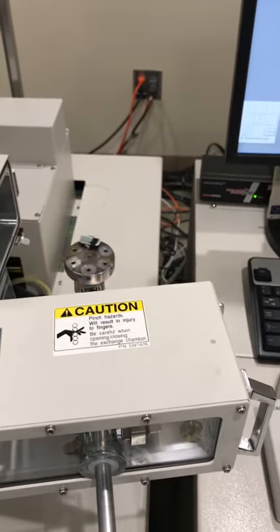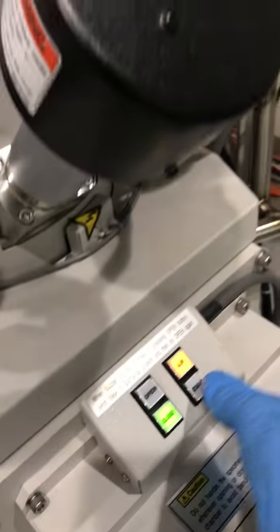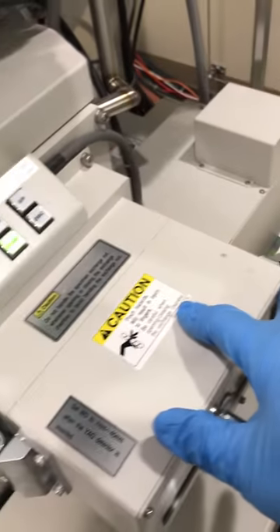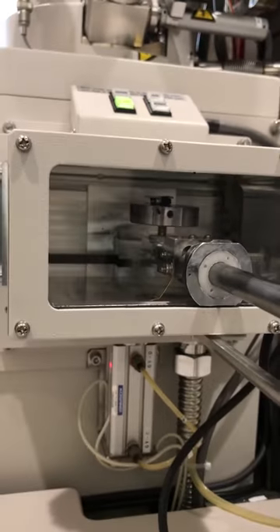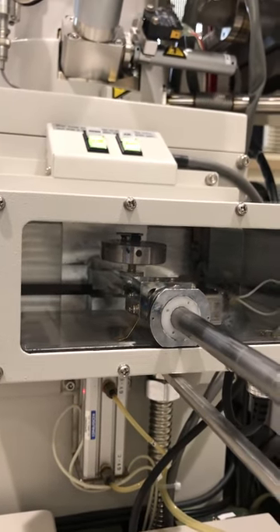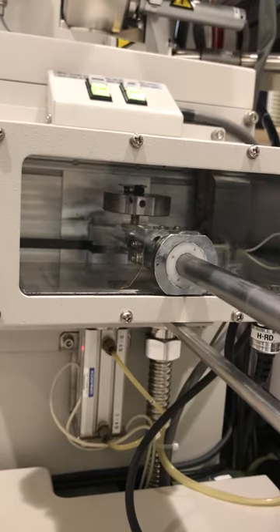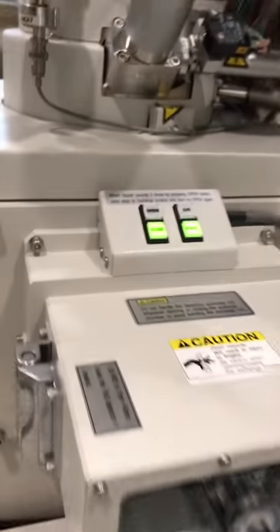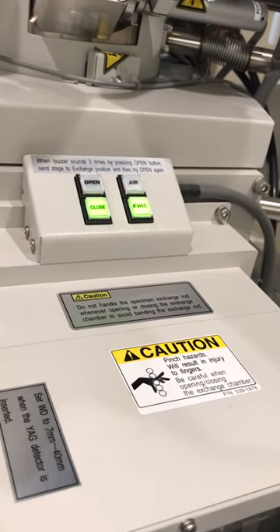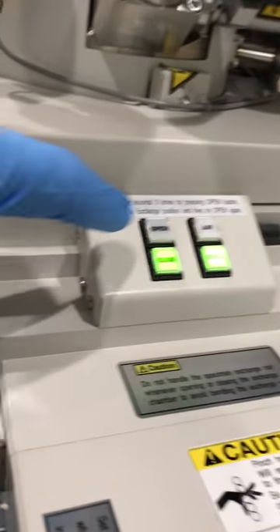Pull the rod back, close the door, and evacuate the chamber — we are now evacuating. There is a door that provides access to the main chamber; right now that door is closed. I'm waiting for the evac button to become solid. I hear the beep sound — it's solid now.